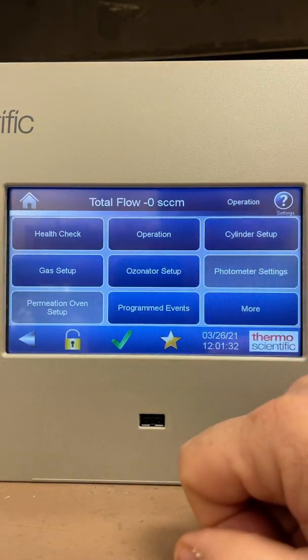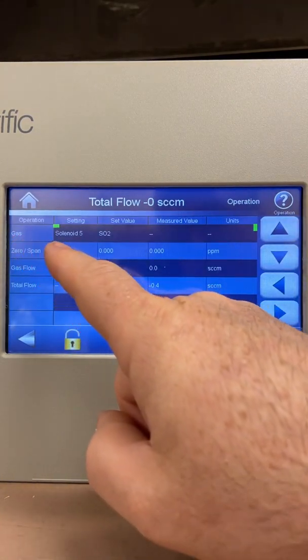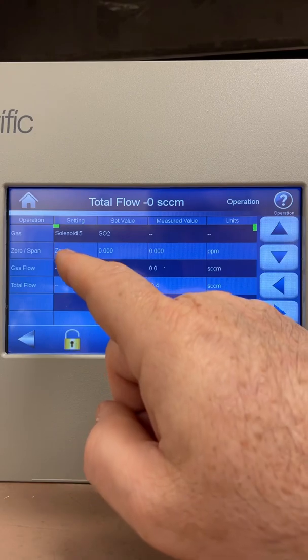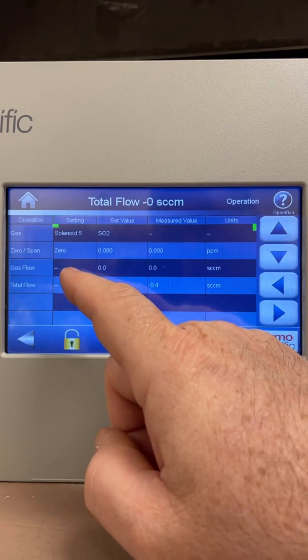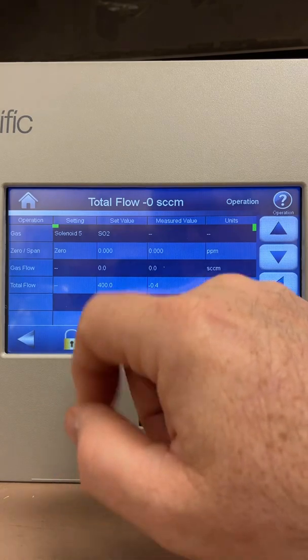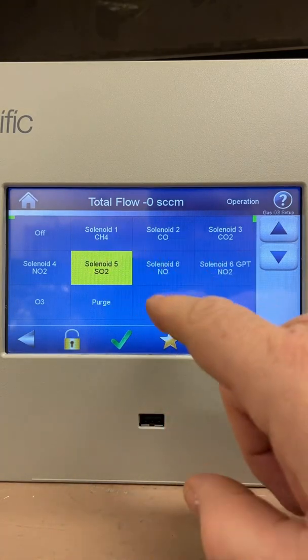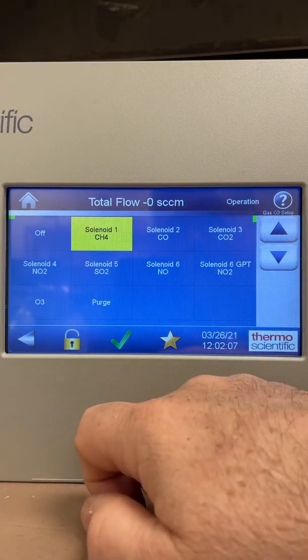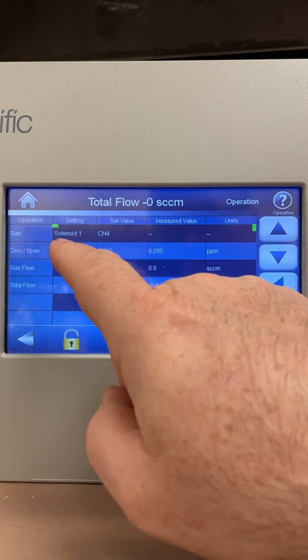If we go into Operation, we'll see the gas solenoid that's been selected, which is solenoid 5 in this case for SO2, and the mode it's currently in, which is zero. If we had air going through it, we'd see our gas flow for SO2 and our total flow. To select a gas solenoid, you can pick one through six. For example, if I wanted to calibrate methane on solenoid channel 1, I would select methane, go back one arrow, and now it says methane solenoid 1.